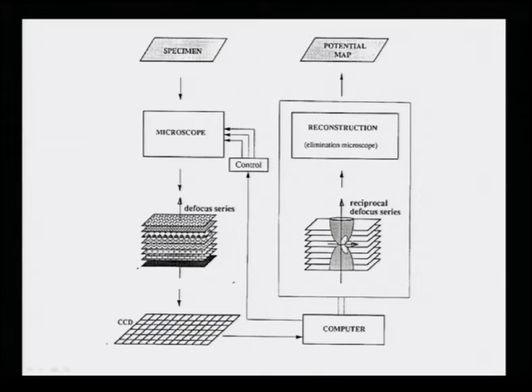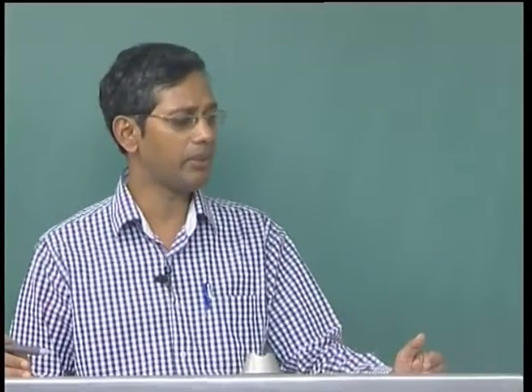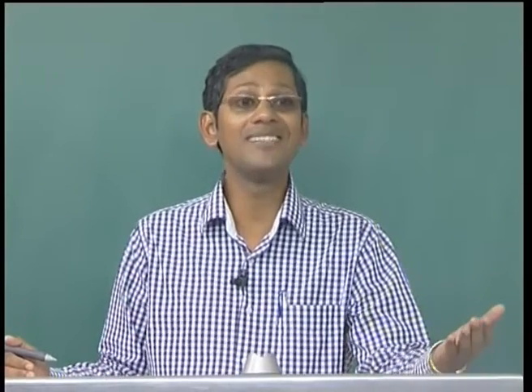I do not have time to talk about each of these techniques precisely because of the time constraint, but any conventional textbook on transmission electron microscopy will provide you the knowledge base for these techniques. The most important technique which you apply day to day in high resolution electron microscopy is fast Fourier transformation. In this technique, we use the actual high resolution image showing the columns of atoms as a real space image, and then Fourier transform this real space information to obtain the diffraction pattern.